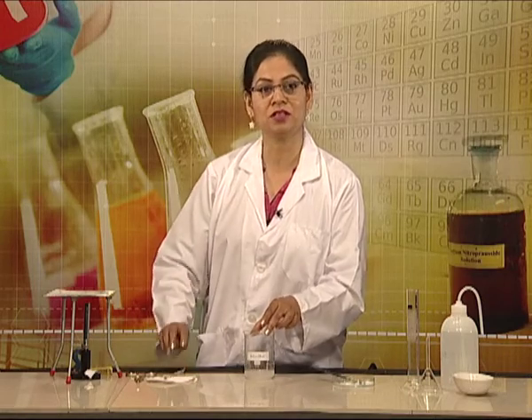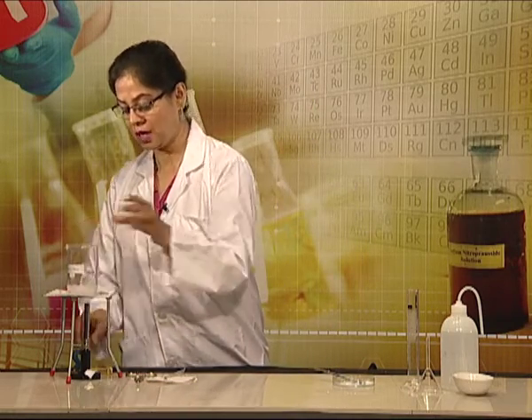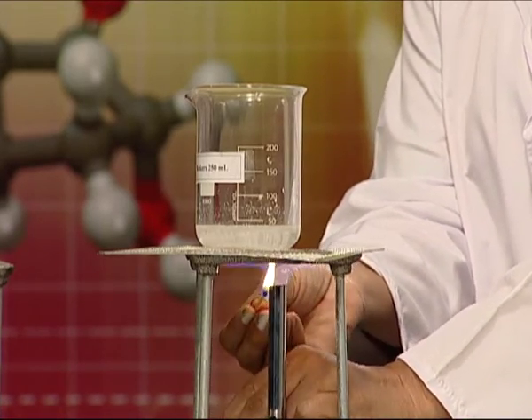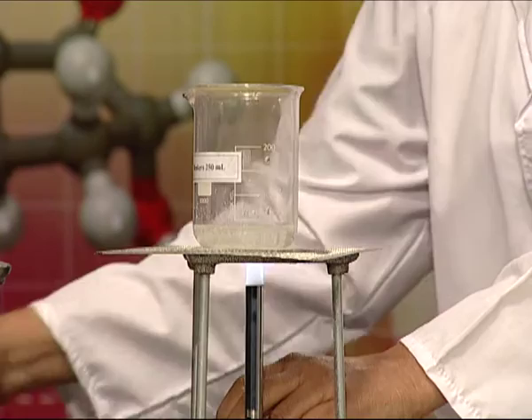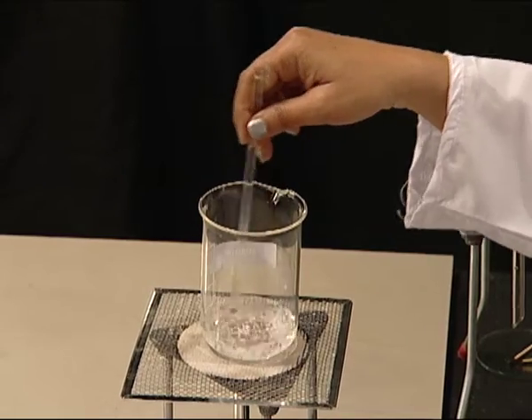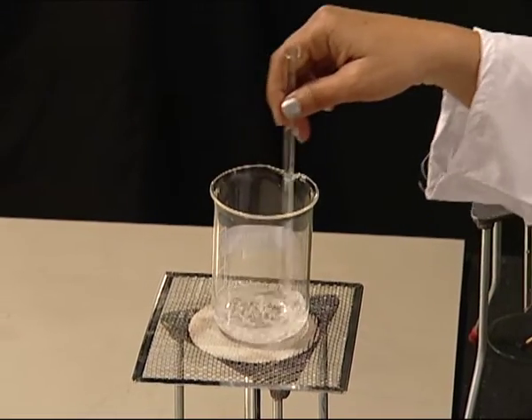Now, we will boil this solution with the help of a Bunsen burner. Heat it so that all the crystals are dissolved.